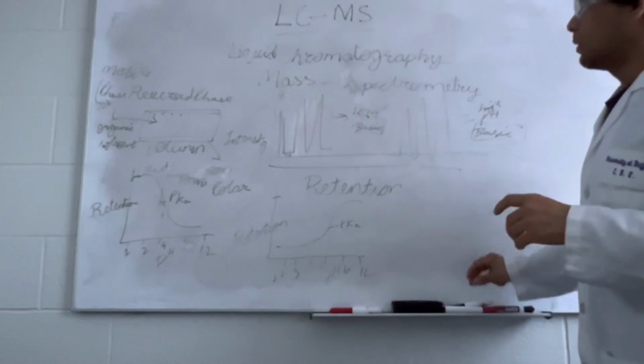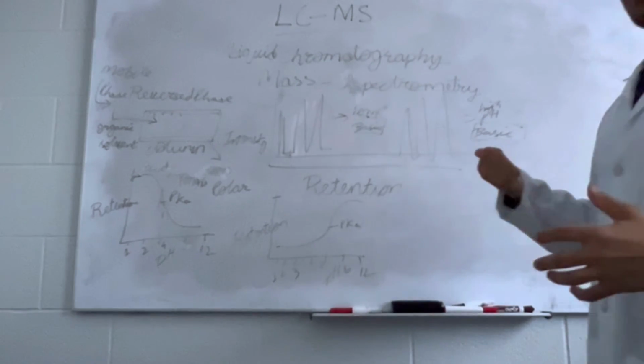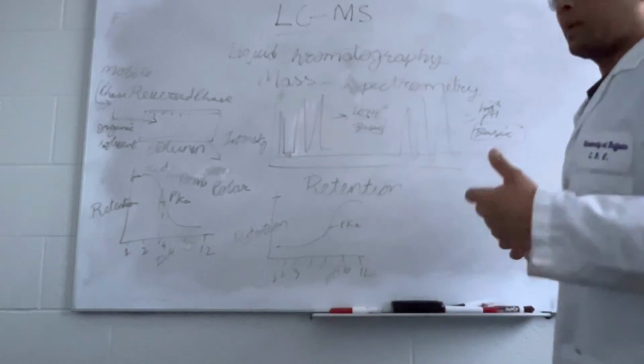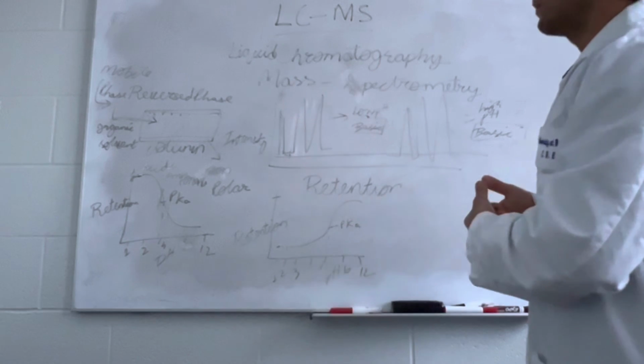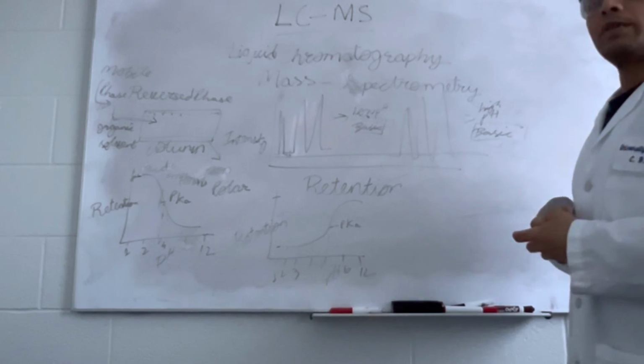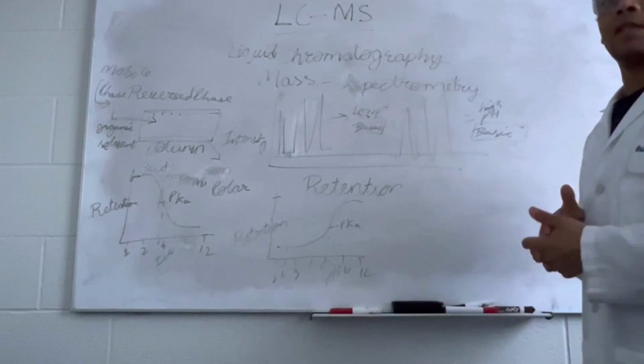So this is a slight introduction to LCMS, if someone is trying to prepare a method to run their sample. I think this kind of basic information is good and essential to understand.